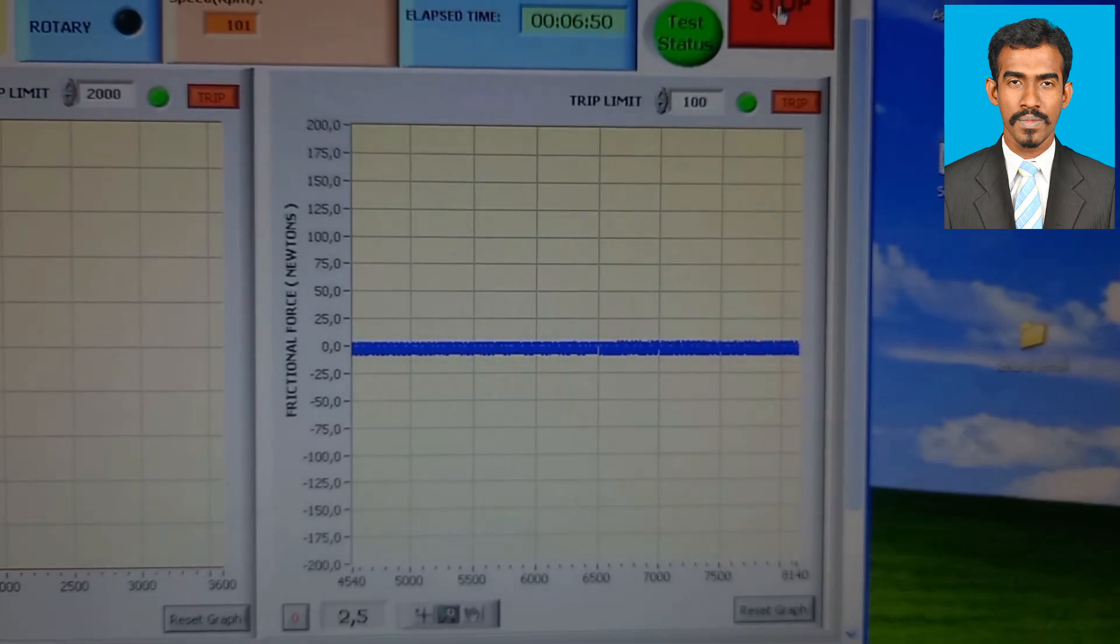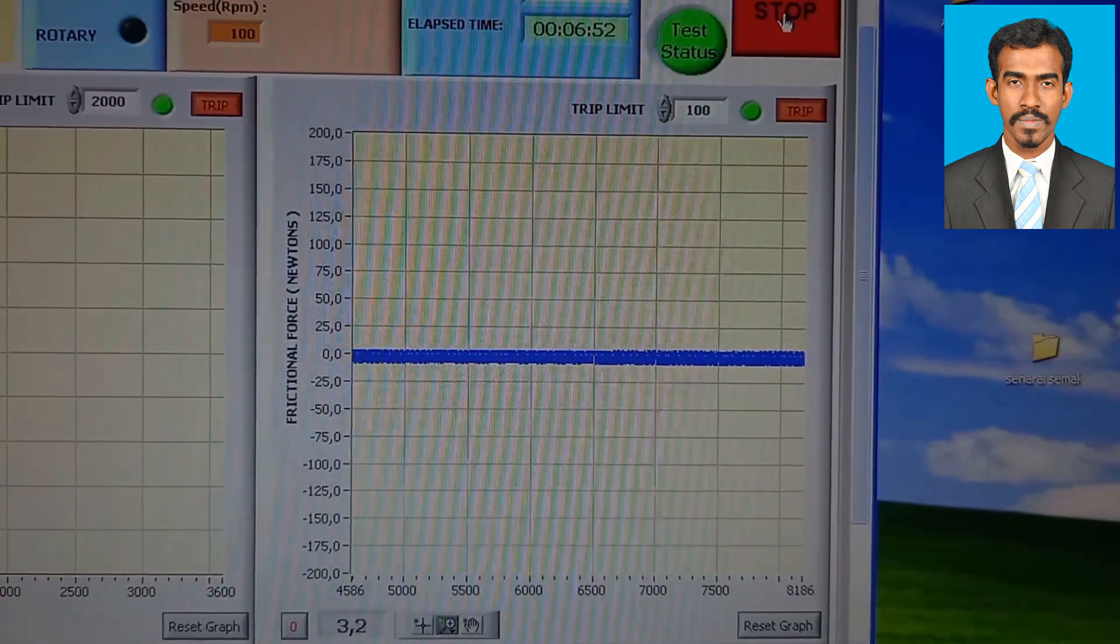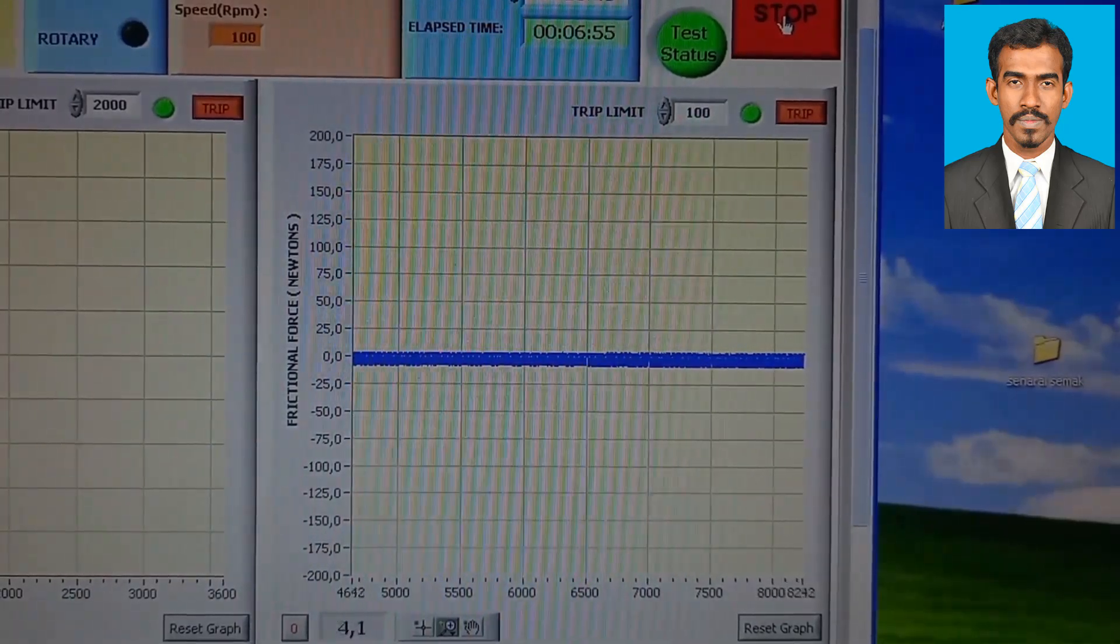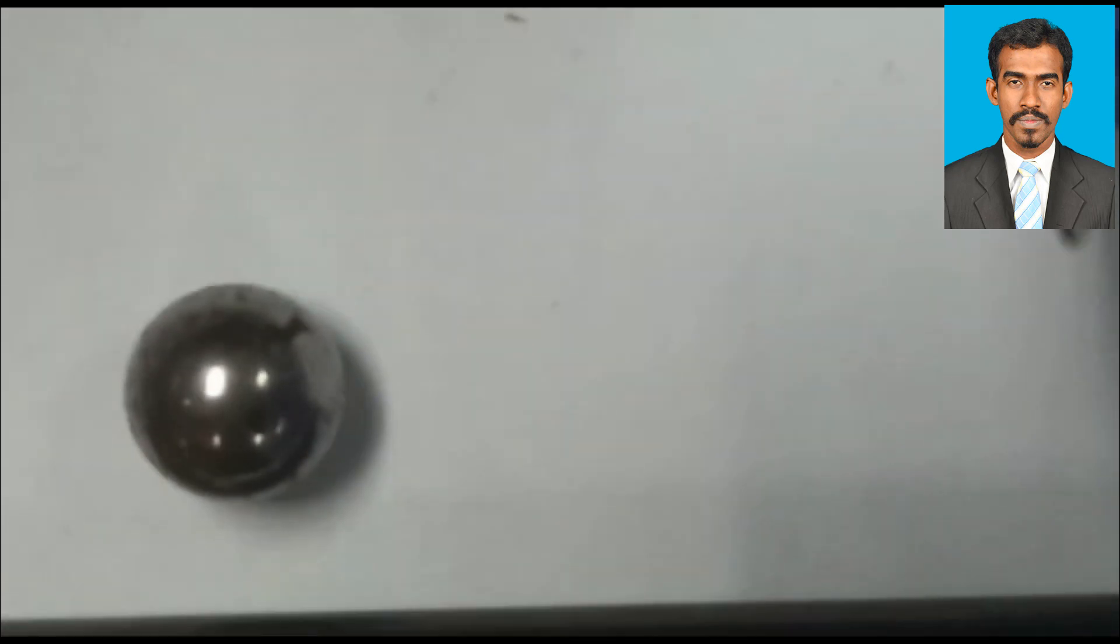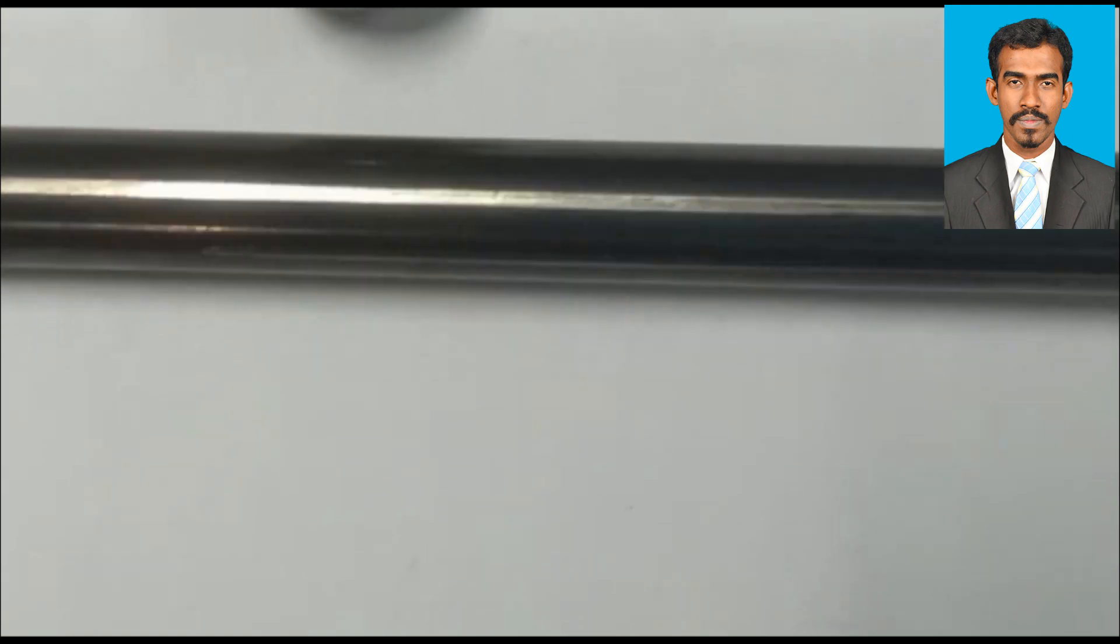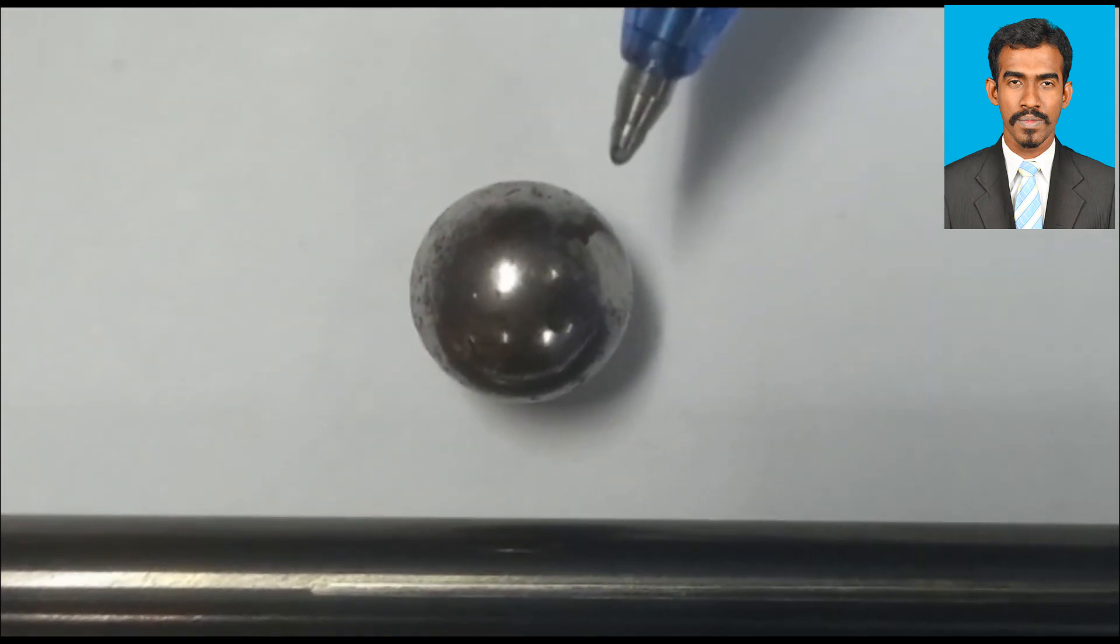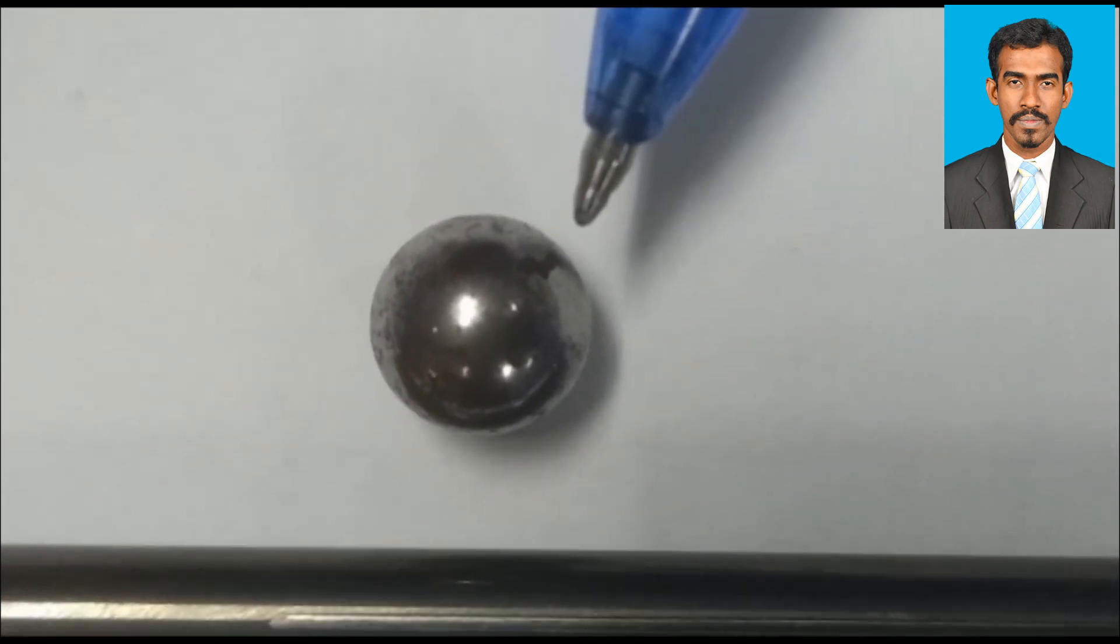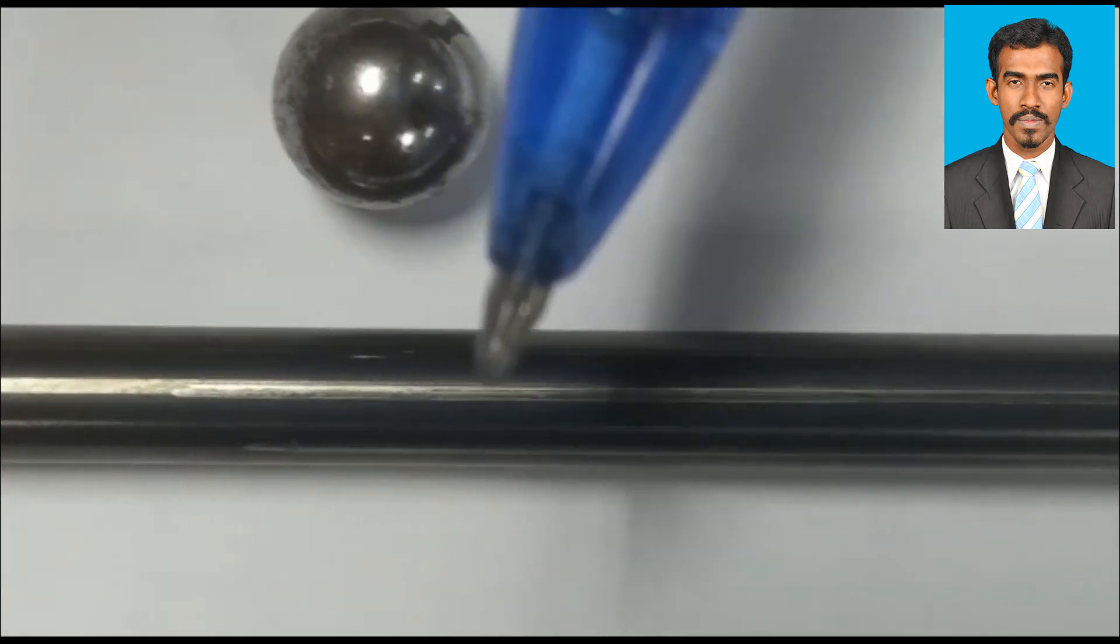After 16 minutes and 40 seconds, I'll obtain a graph like this. Then we'll remove the specimen and the ball. Here we can see that we are recording both the ball and the specimen. There are instances where wear occurs only on the ball or only on the specimen, depending on the hardness of these materials. In my experiment, the wear occurred on both the specimen and the ball, as you can see.